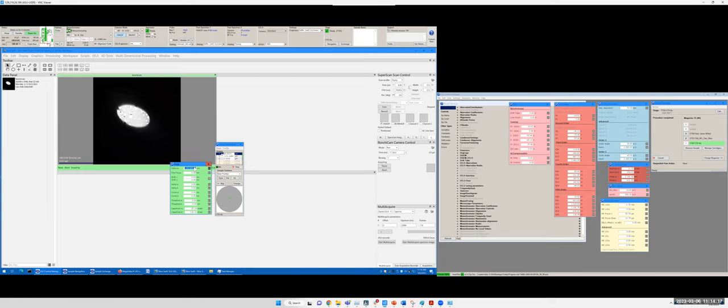You need to see the beam. If you don't see the beam, even after moving around over a large distance, something is wrong and you need to report it as a fresh user. Okay, now suppose we already see this beam. What we want to do is officially start to align this beam.